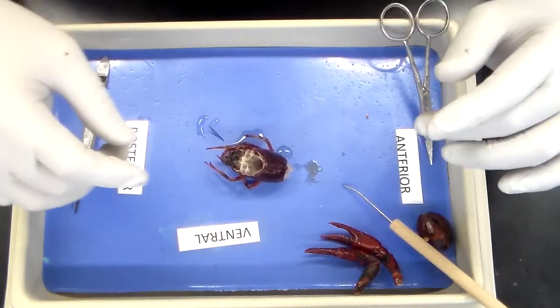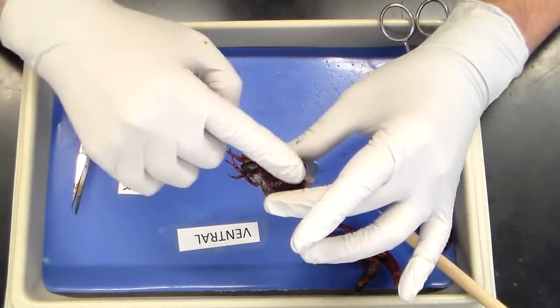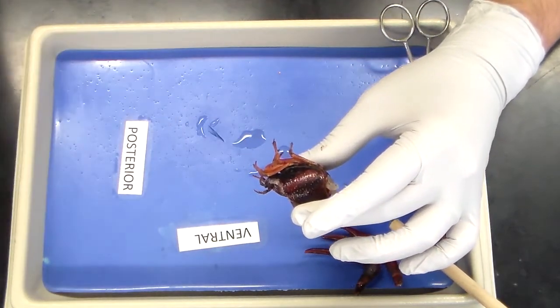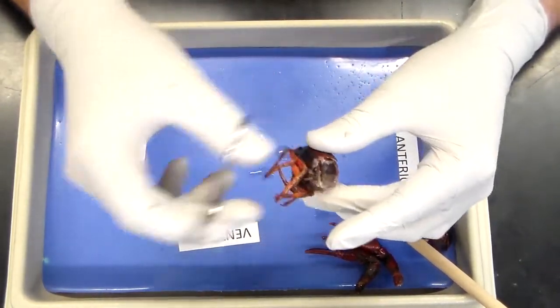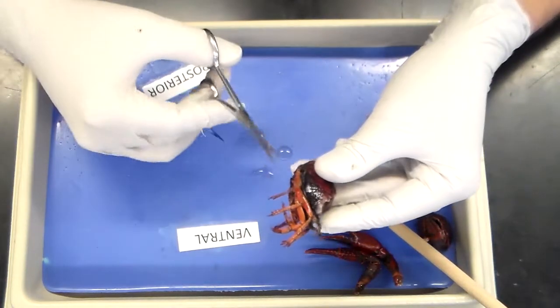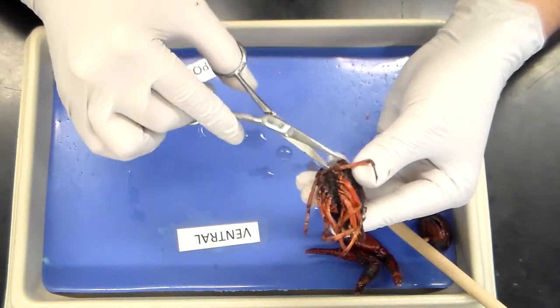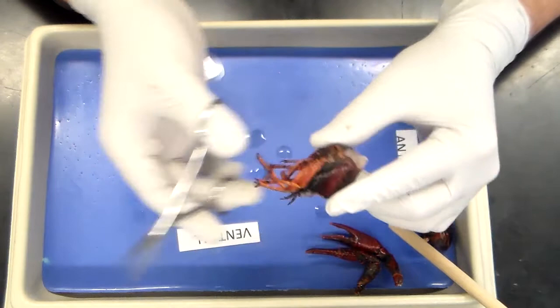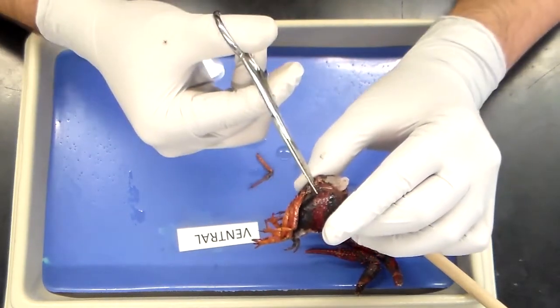The next thing we want to look at are the gills. The gills are housed in the thoracic cavity, underneath the carapace. To get to that, we're going to use our scissors, and on the posterior side, we're going to remove the third walking leg entirely. This allows us an entryway underneath the carapace.